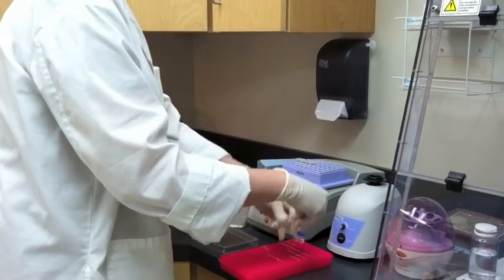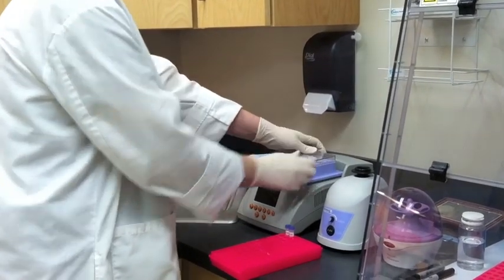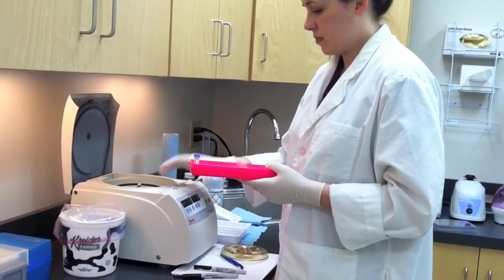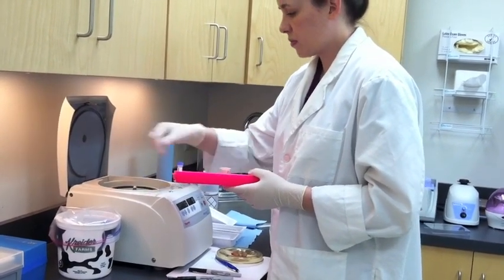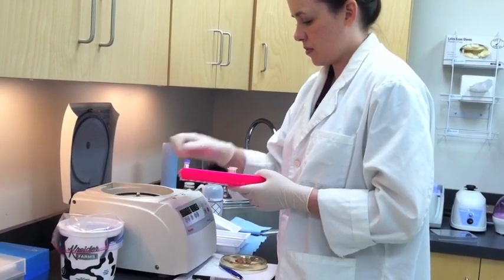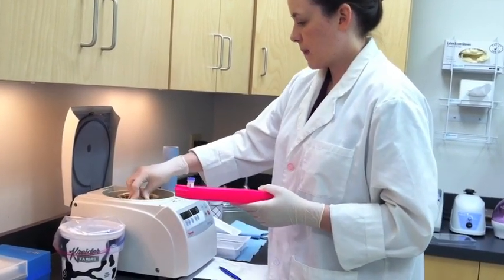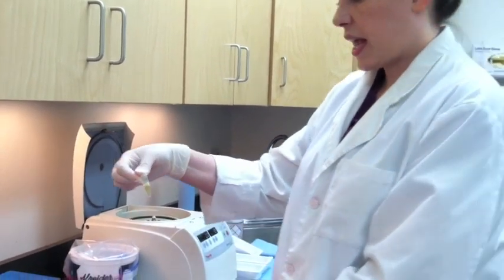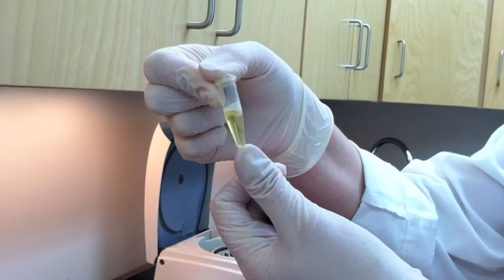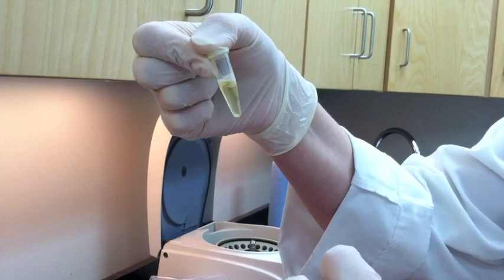This automatically keeps track of time and regulates the temperature for the 5-minute incubation. After centrifuging, you can see there's a small pellet at the bottom — that's where the bacteria is. I'll remove all the liquid at the top with a pipette.